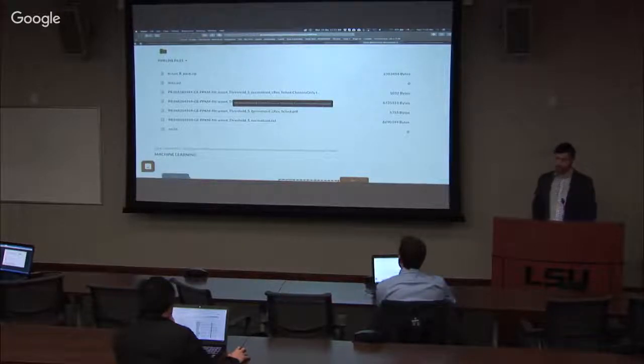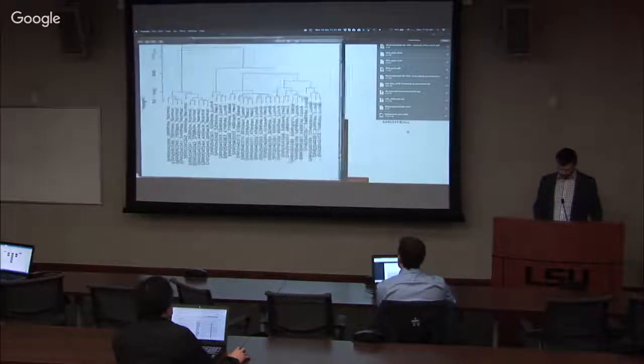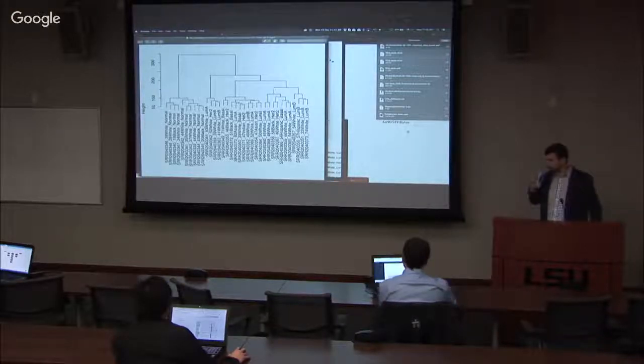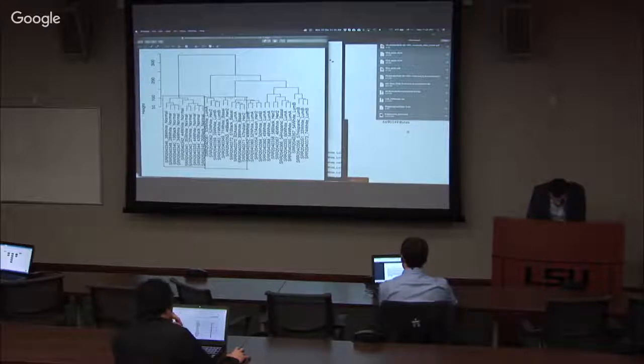So first of all, you have this PDF, which is going to be the dendrogram. And this is the DCIS data set, right? So a different data set. Now, what do we see here? We see here a normal cluster right here, right? Because this is already normalized. And then we can say, well, okay, let me just see all the rest right here, right?